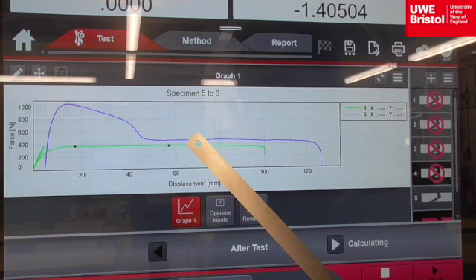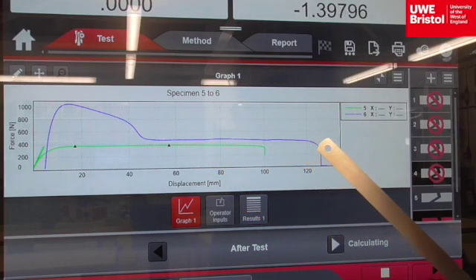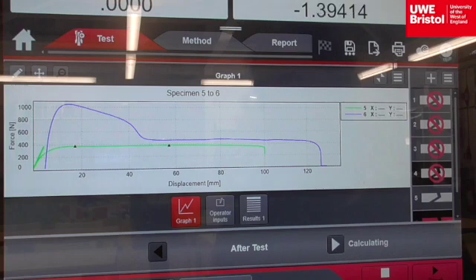This is a low-density polyethylene just below 400 newtons, and the high-density polyethylene requiring less than 500 newtons of force to maintain the rate of extension. In both cases, the rate of extension was 65 millimeters per minute, so once those high crystalline crosslinks are broken, high-density polyethylene basically behaves the same as low-density polyethylene.